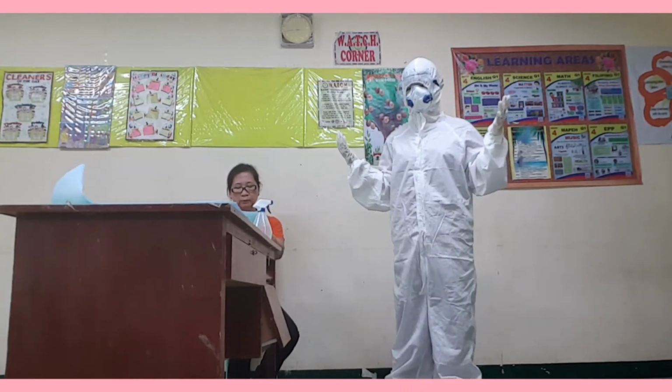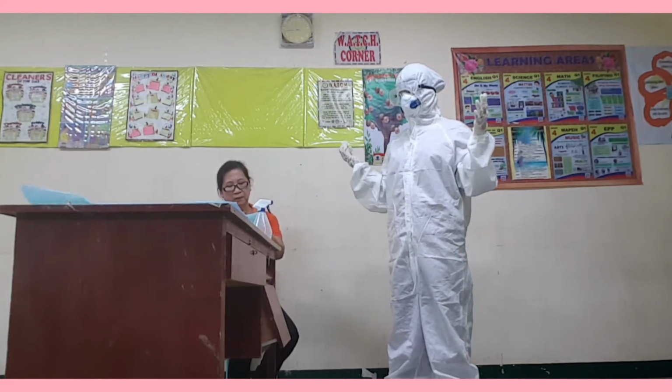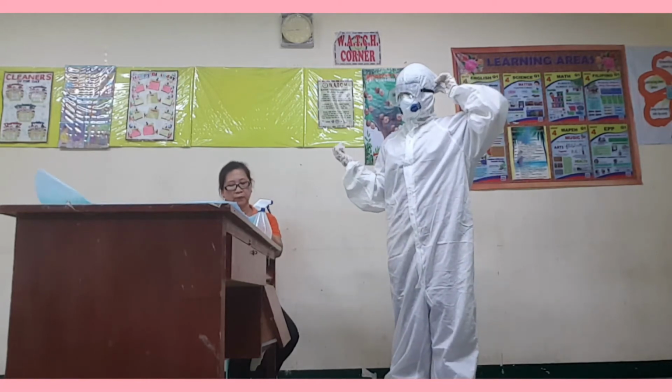Procedure number 10, remove goggles. Lift back of the strap over your head. Pull out and away.